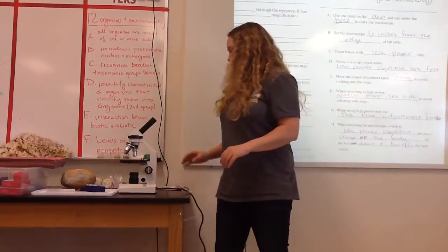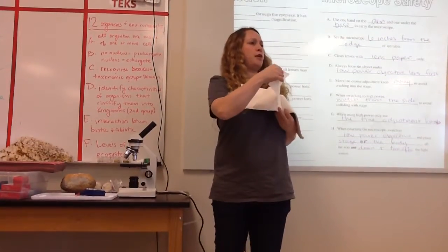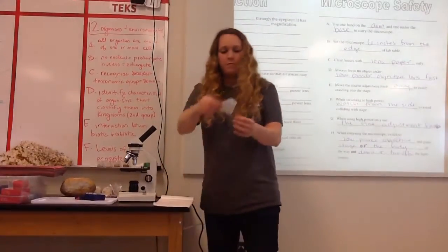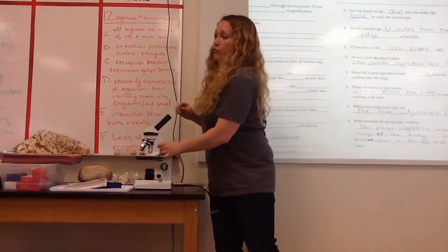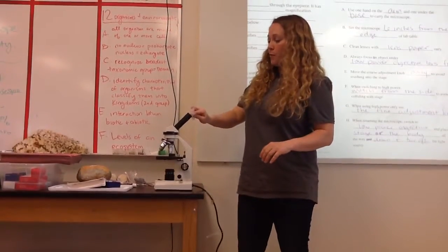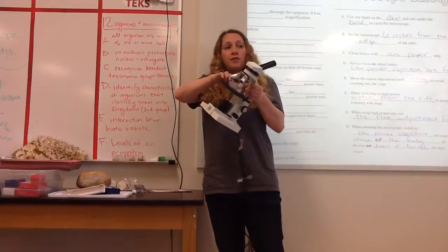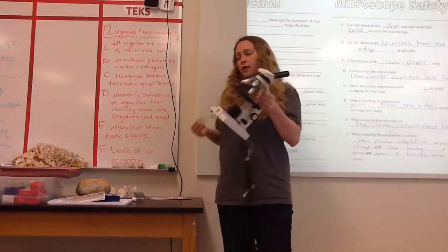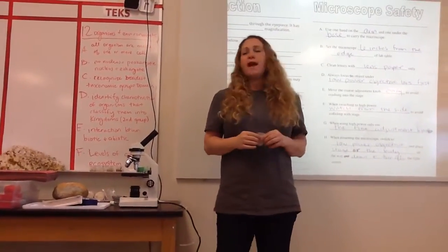Does that make sense? Okay, so this is lens paper. It's kind of white like wax paper, but it has a special texture that will not scratch the glass. So what you do is you just get a little piece. See how thin it is? And you clean off by rubbing. Don't let your finger touch it, though, because your fingerprints will also stay on the glass. And then when you look through, you'll see fingerprints magnified. So take it, rub it on the part you're cleaning. Could be here on the eyepiece. Could be on the objective lens tip. It could be on the glass on the stage. And it usually wouldn't be, but it could be underneath as well. Okay? Nobody usually touches down there. So 6 inches from the edge, nice and clean, we're good to go. Okay? What are you never going to use?